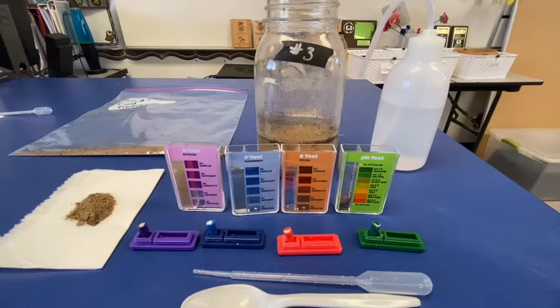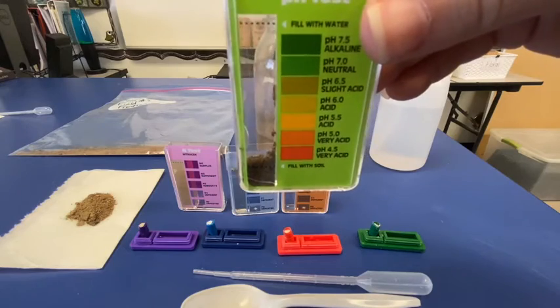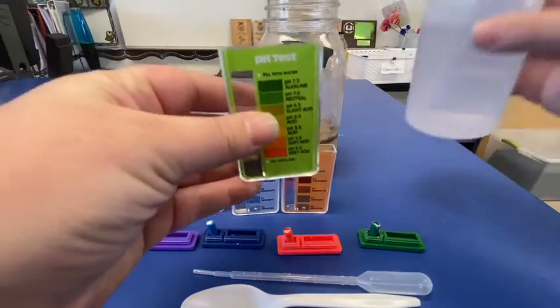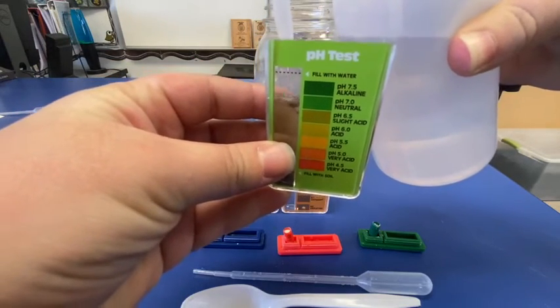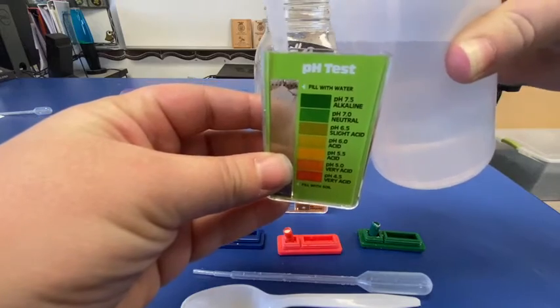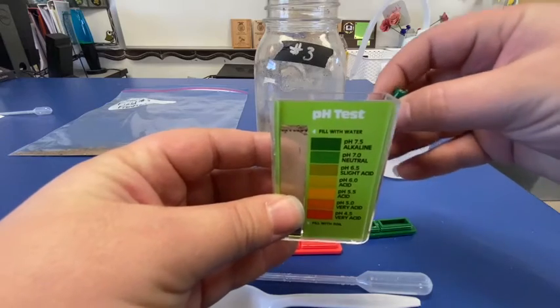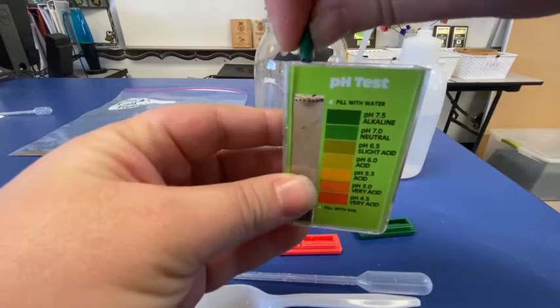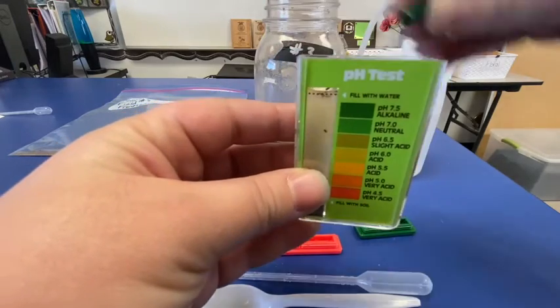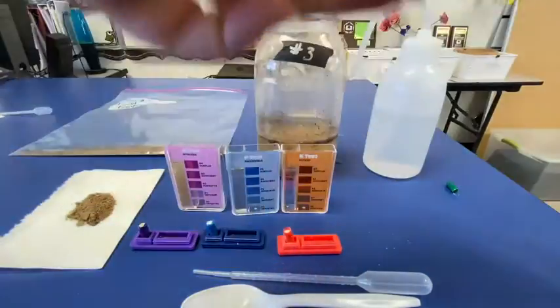So what we can do, I'm going to begin with pH. I have filled our pH to that fill line. I'm going to fill to that second fill line with distilled water, making sure it's all the way. And I'm going to take our capsule for pH sensing and place it fully into our test. I'm going to cap our sensor, making sure that it's secure, and I'm going to shake.